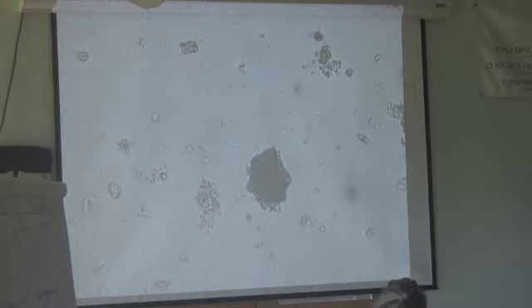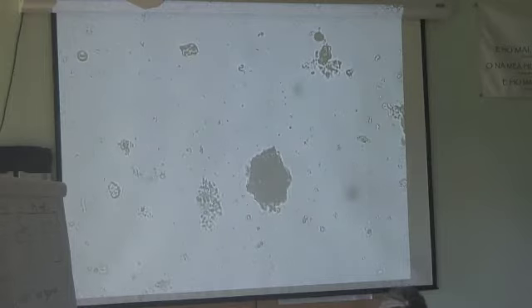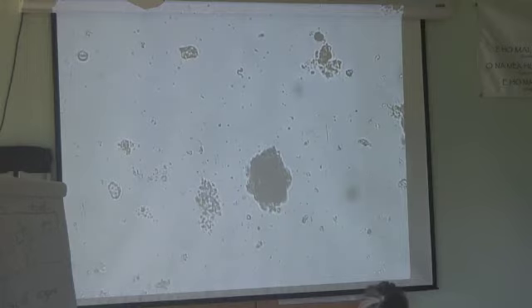And how can you tell the lactobacillus from the actinobacteria? You can see the actino, looking over here, see how the actino is curved, it's bent, it branches. Okay. So if it's not really straight, you would say that it's probably an actinobacterium, whereas lactobacillus is nice and straight and long.